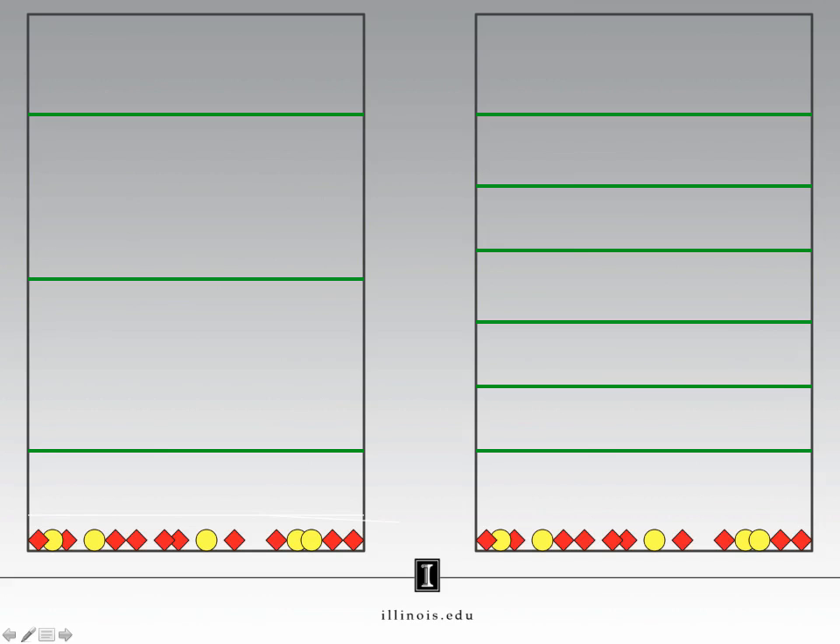Here is a visual demonstration of how the number of theoretical plates within a fractionating column affects the composition of the liquid collected during a distillation. Here we have two different fractionating columns with the same amount of compound in the mixtures at the bottom of each column, but the number of plates inside each column is not the same. This column on the left has three plates; this column on the right has six plates. Let's start distilling the mixture on the left. We're going to boil our liquid to make some vapor, then the vapor will condense on the first plate. It's going to heat up again, make vapor again, condense on the second plate.